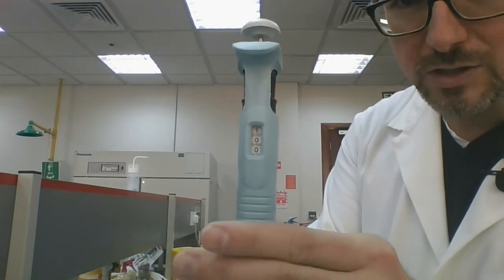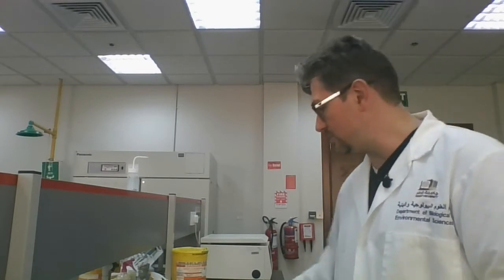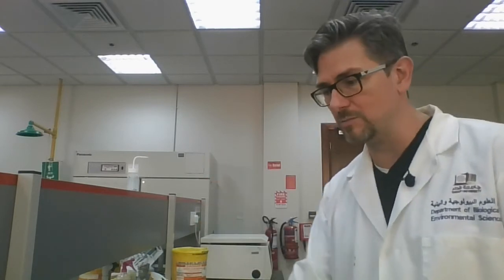I will be using this to add the next solution, but before I do that, I need to remove my epi tubes, and I will be emptying them out into a waste beaker. So I have a waste beaker that I'm going to be using for bacterial waste. That's going to be a biohazardous waste container. Okay, and so I will be disposing of the liquid first.